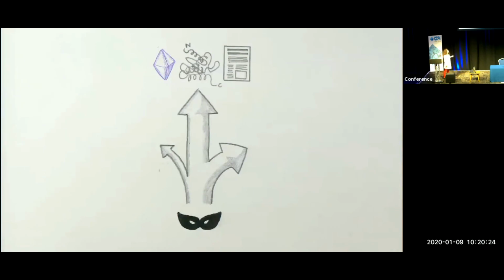So for example, I'd like to have a look at fitting to multiple data sets. There aren't very many options available for doing this at the moment. And sometimes it's the way where people are able to get a foothold on their model, but it's not quite easy enough to do so yet. I'd also like to have a look, because the model is so different, because it doesn't use B factors, it might be very interesting to apply this to cryo-electron microscopy data. It might be complementary to what's being used at the moment, but I haven't looked down these side routes yet.